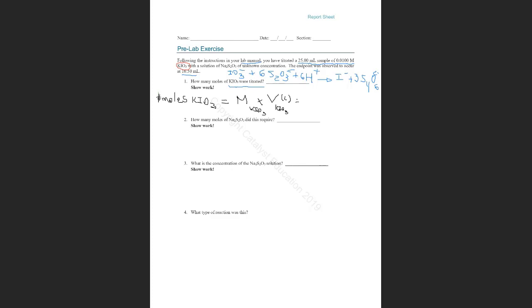Do we have that information? What is the molarity? Here, it's here. 0.0100. And it says molar. What is molar? Moles per liter. And we multiply by what?